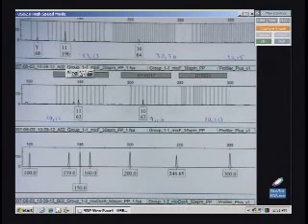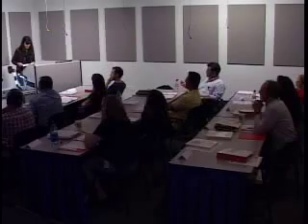So then you got the 11, but you missed the 10. And here you got the 10, but missed the 9. And then here there's nothing, obviously. So you did get some profile. Just kind of going through this, and this was, again, for 30 sperm. Kelly had talked about their target being 50 sperm, and they get nice results. And typically, my target is 30 sperm, and I get nice results.